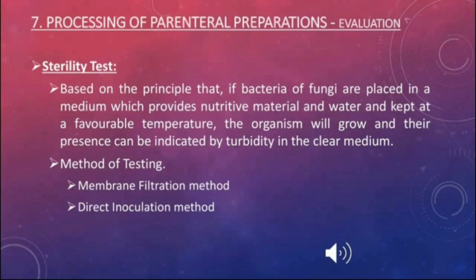Second, direct inoculation method. In this method, the specified quantity of sample under test is drawn aseptically from the container and transferred into a vessel of culture medium. Mix the liquid with the medium and incubate for not less than 14 days. Observe the growth of microorganisms in the medium. The following observations are possible.